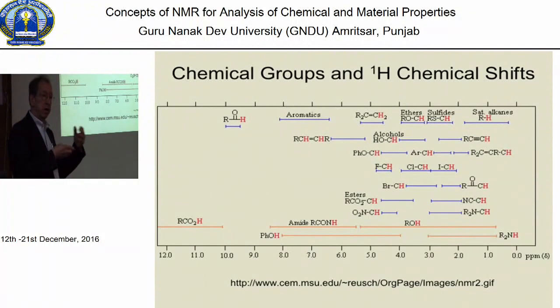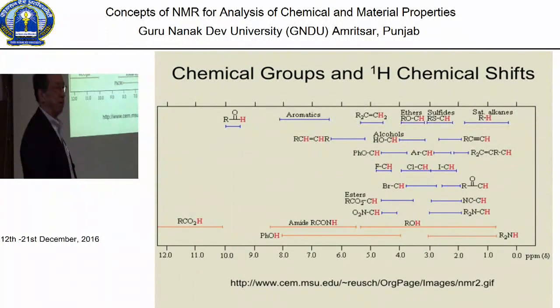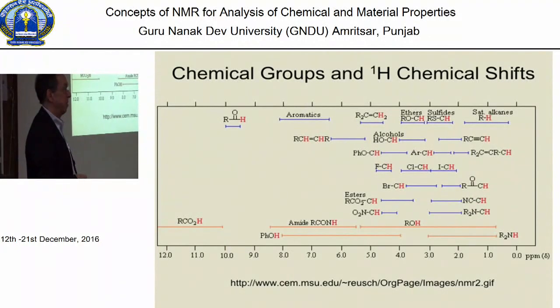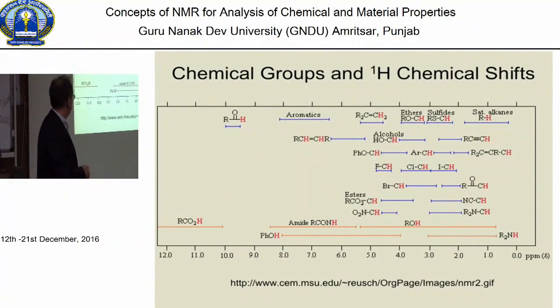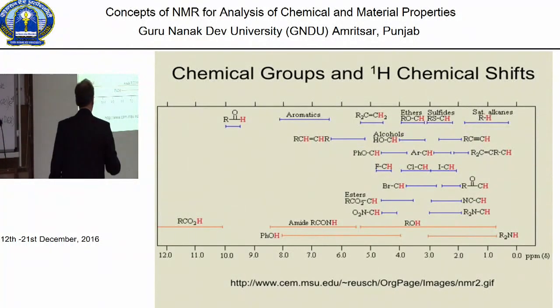And the other nuclei where the electron density has been removed, which are de-shielded, appear at the left of the NMR spectrum. And oddly, the ppm scale goes from right to left. So typically, at least in my part of Europe, they draw the scale from left to right, but they also draw it on the other side.